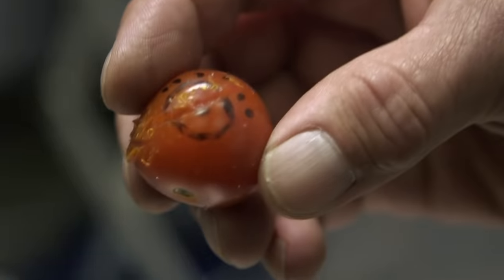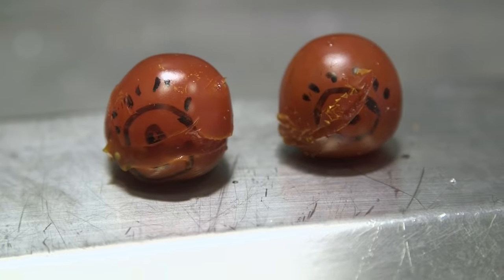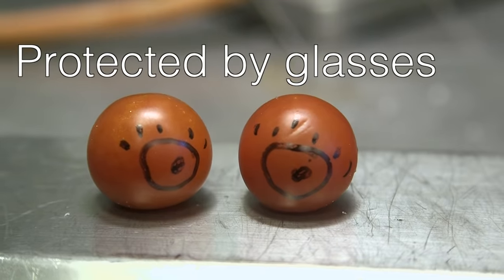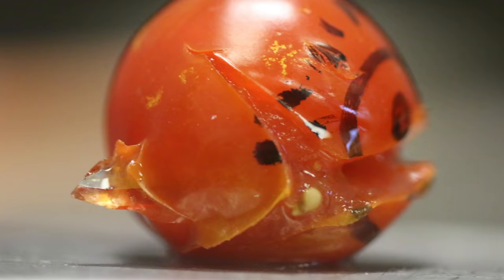If you look at the poor tomatoes, you can see that the ones without safety glasses were pierced by pieces of glass. One of them was actually peeled, giving new meaning to having your eyes peeled. You can see where the glass went through the eyeball.